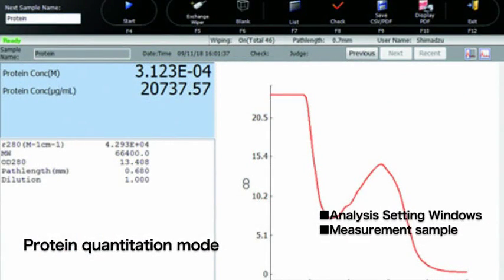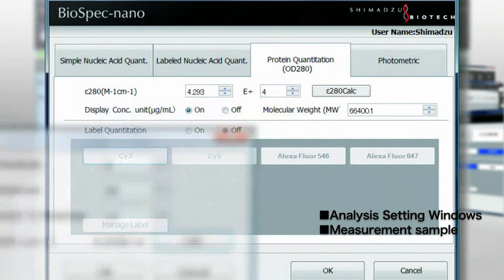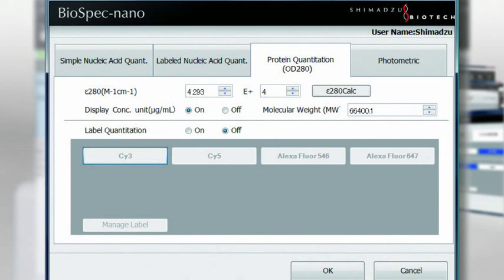And, of course, the BioSpec Nano has a protein quantitation mode. Protein concentration is calculated from the peak optical density at 280 nanometers. In addition, for labeled proteins, the label concentration and labeling ratio can be determined.